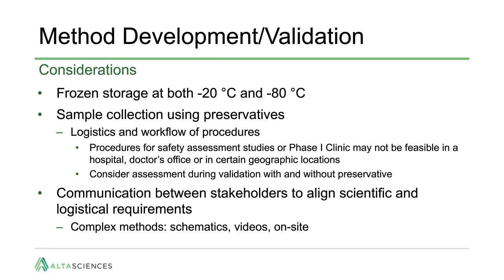The FDA 2018 and ICH-M10 do discuss equivalency of temperature for storage between -20 and -80 C. In my opinion, assessment of both temperatures during method validation is not a significant amount of additional work and is much more efficient than coming back for these assessments later, when samples may not have been stored at the appropriate condition, especially for larger multi-site studies.